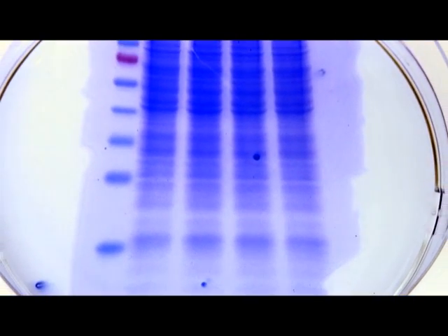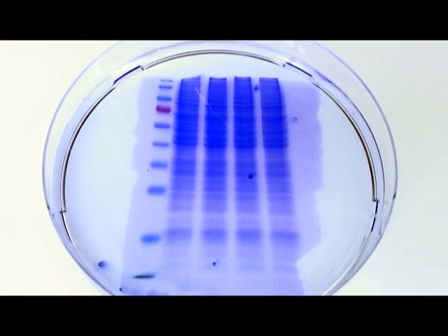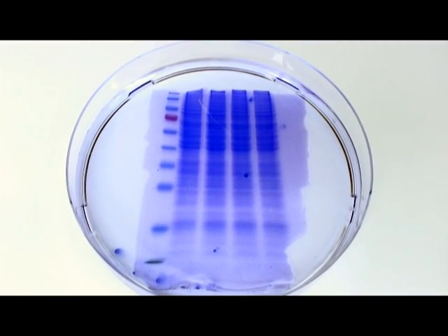After the proteins have been separated by electrophoresis, the Western blot technique allows us to identify one protein of interest among others that migrated through the gel. For the Western blot, you will need to transfer the proteins from the electrophoresis gel to a nitrocellulose membrane. Then use two different antibodies, the primary antibody, which specifically recognizes a protein of interest. Our primary antibody will be a monoclonal antibody against our target protein, alpha-tubulin. This antibody was produced in a mouse.